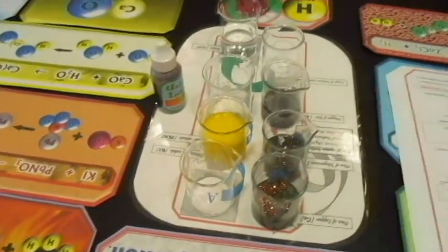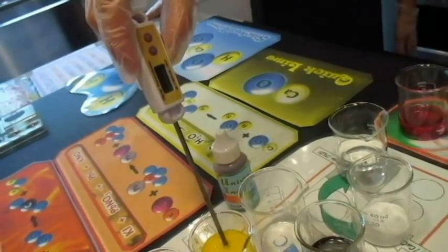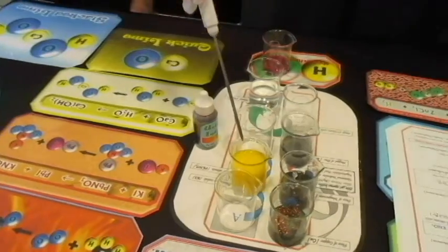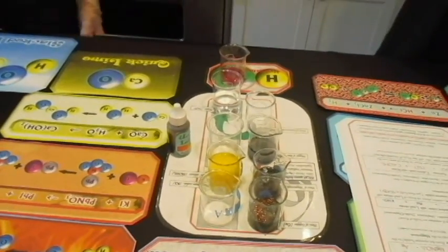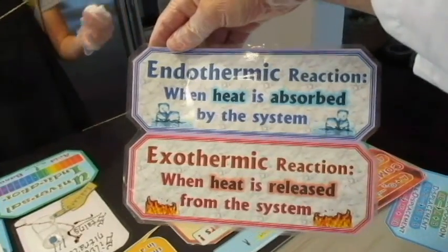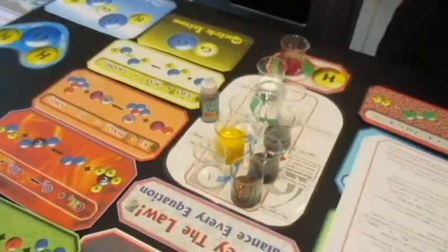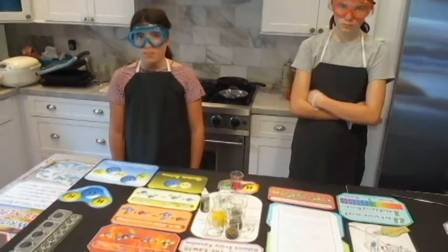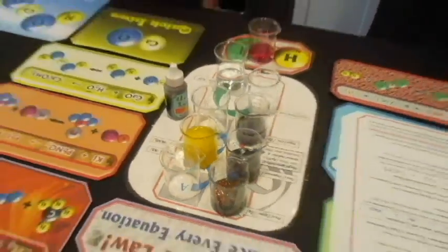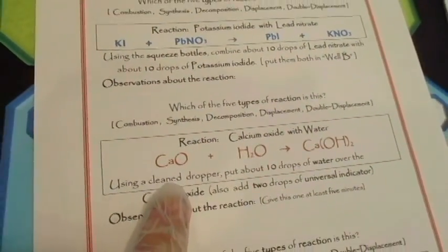Let's get one more temperature of that right now, because we can assume the reaction has peaked. It seems like it happened very quickly. 24.4 Celsius. So if it went up like 0.4, right? Yeah. Very little. So that will help you determine if it's an exothermic or endothermic reaction. Just remember, some reactions are just barely in either category. Some of them just barely register. Okay, that's a pretty one, right? So our next reaction is going to be calcium oxide plus water.